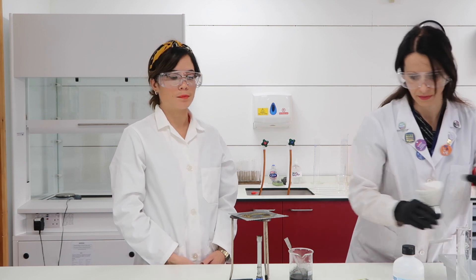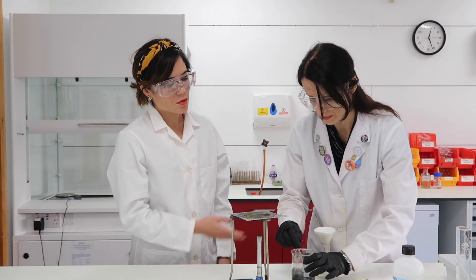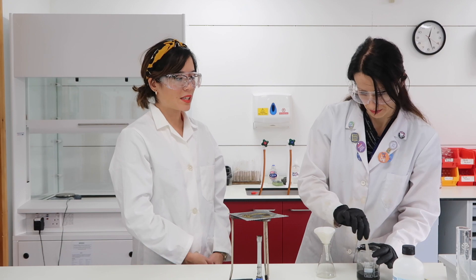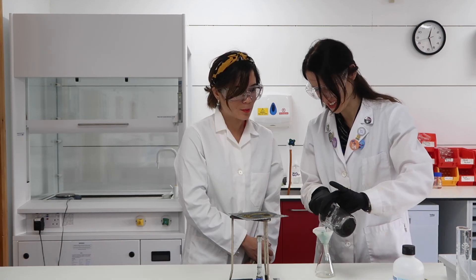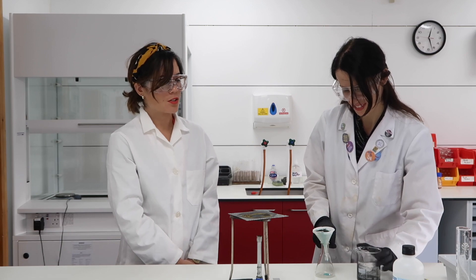It's now essential that we remove the excess solid — the excess copper oxide — and we're going to use filtration to do that. This is your typical setup: a conical flask with a funnel containing filter paper, which Emilia will now pour the solution through. Oh, it's beautiful isn't it? That colour of the copper sulfate solution is so beautiful, so characteristic.